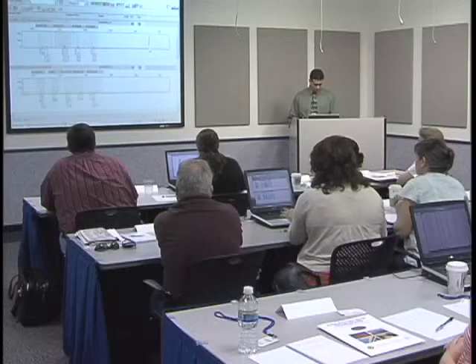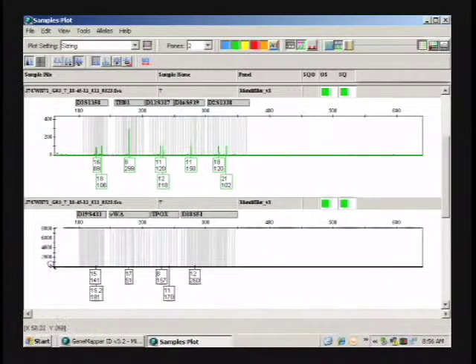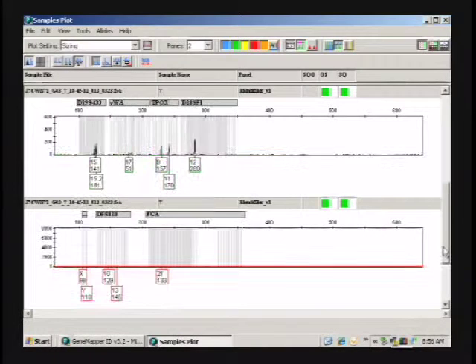Well, we still got something. However, it doesn't really look like... I don't know if this is actually an increase, because your original data was about, for this would have been a 0.1 nanogram sample. So the original data was probably about this high, or maybe even a little higher. So I don't know if we actually got an increase off of that.